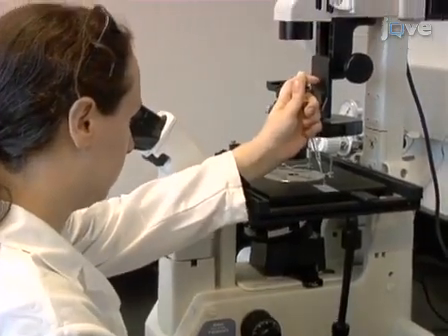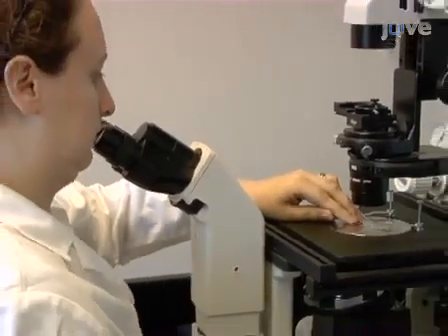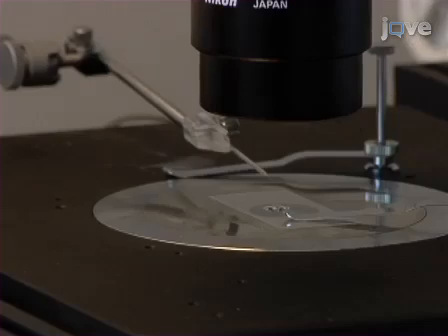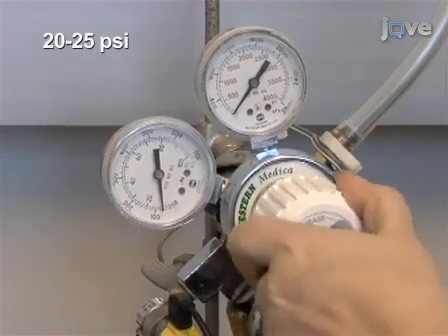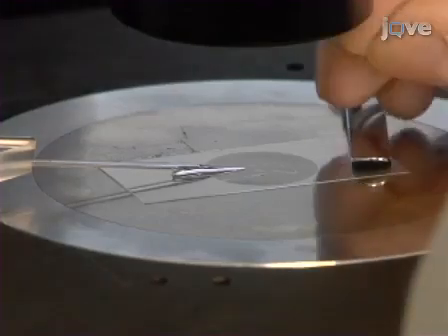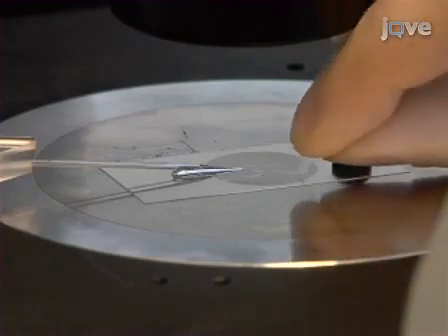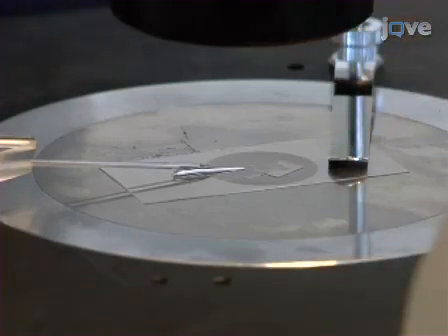Now, place 2 drops of heavy mineral oil onto the injection pad. Place the injection pad onto the microscope and lower the needle into the oil. Apply injection pressure and observe whether fluid flows out of the needle. If not, you will need to gently break the end of the needle by gently driving the tip into a small bit of broken cover glass placed on the injection pad. After the needle is flowing, proceed with the injection.